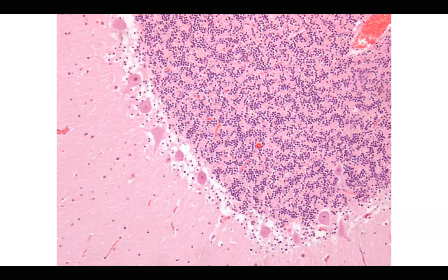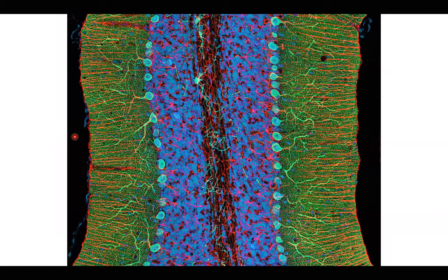Even at high magnification, we see only a few bits of dendrites. But here we have a fluorescently labeled folium of the cerebellum — we can see axons traveling in the white matter, the two layers of gray matter, and the Purkinje cells. Several of them show their beautiful elaborate dendritic trees extending out into the superficial layer of the folium.